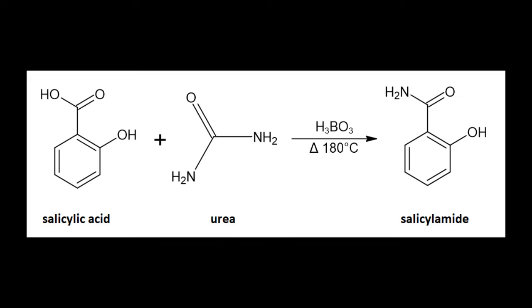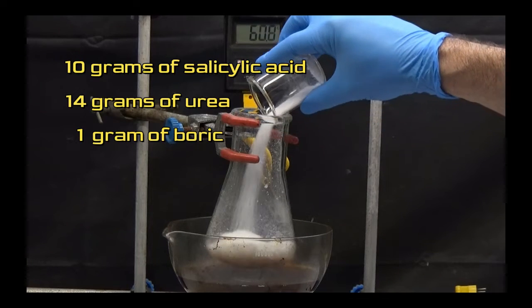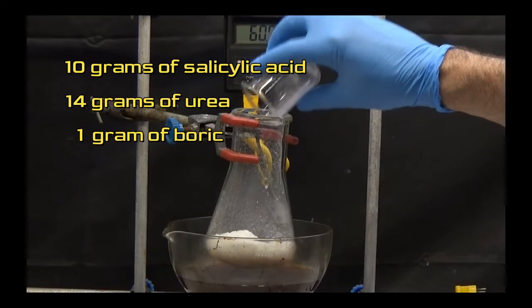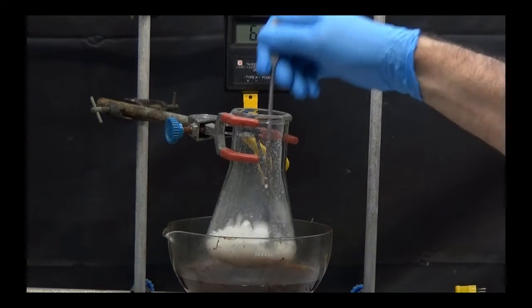In the second step, we obtain salicylamide using the salicylic acid obtained, urea and boric acid as a catalyst. To proceed, we will put 10g of salicylic acid, 14g of urea and 1g of boric acid in a 250ml flask.